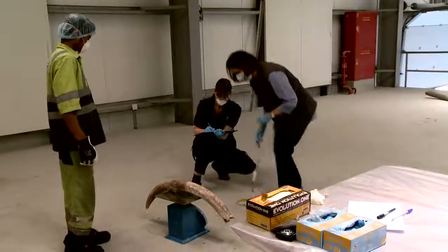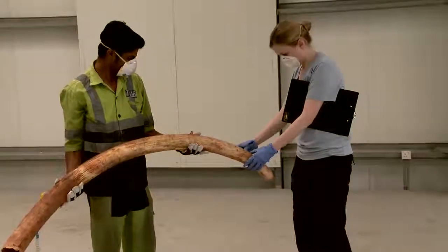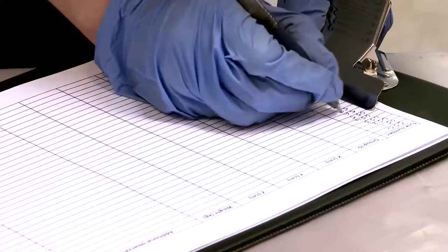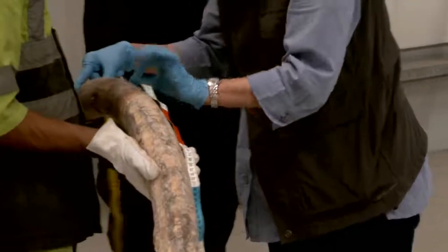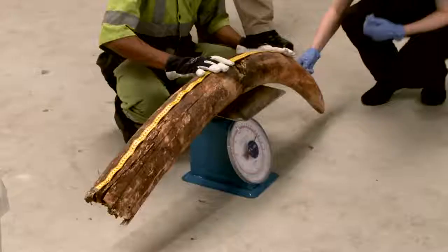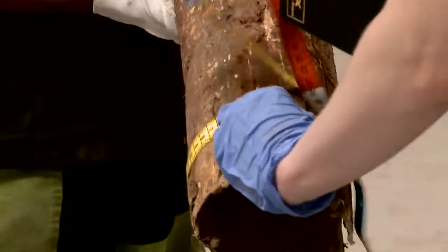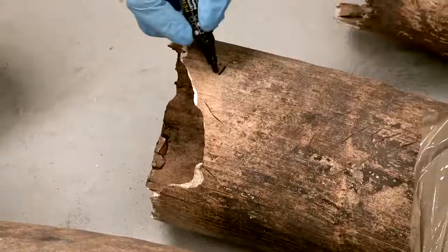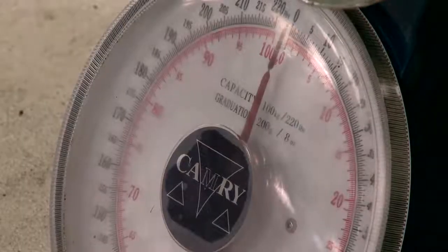Weigh the tusk and measure its length. Record these measurements on the data sheet. Use a new line on the data sheet to record information for each individual tusk. If the tusk has a CITES serial number, this should also be added to the data sheet. Repeat until every tusk or tusk section has been numbered, measured, weighed and recorded on the data sheet.